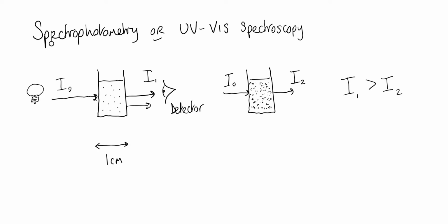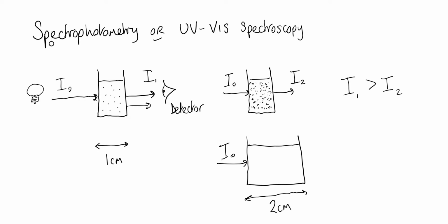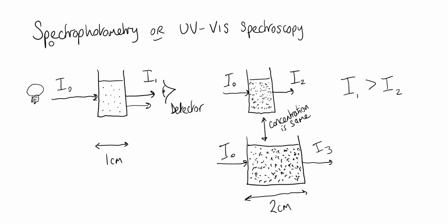A second thing that we have to recognize is that supposing we were to double the length of the cuvette, so maybe now instead of 1 centimeter, that cuvette has a path length of 2 centimeters. We start again with our intensity of light I0, and we're going to have the same concentration of our dye in these two cells. The intensity of the light, let's call that I3, coming through that path length of 2 centimeters is going to be even less. So the intensity of the light I2 must be greater than the intensity of the light I3. This is as if we put on a second pair of sunglasses, and the world outside would seem even darker.